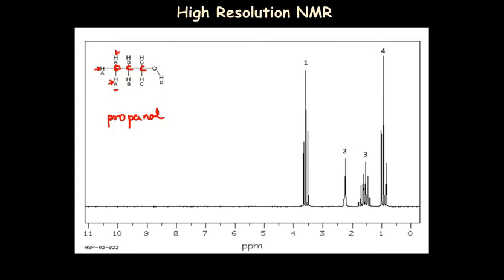So the environment of all these A type hydrogens is the same. The second type of proton is named B here, and both these protons are of the same environment because again they are bonded to a single carbon, besides which we have one methyl group CH3 and on the other side CH2. So the environment of these hydrogens is the same.